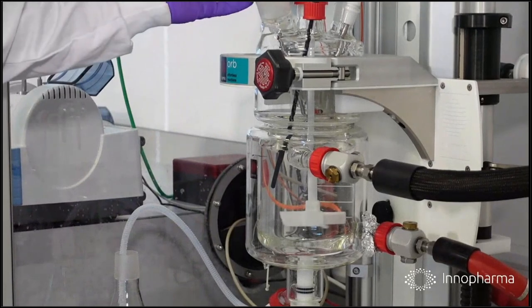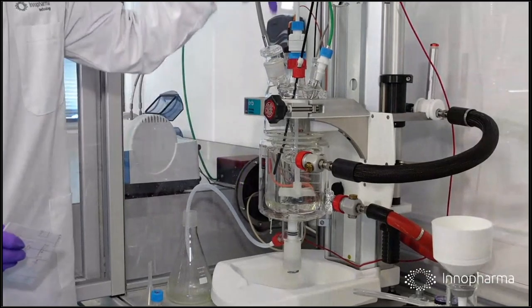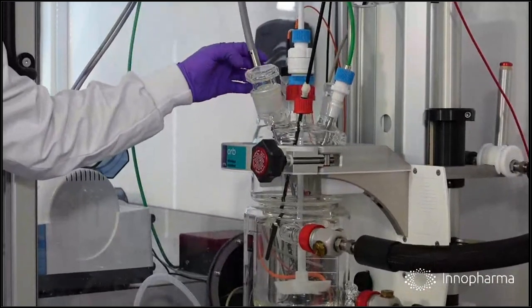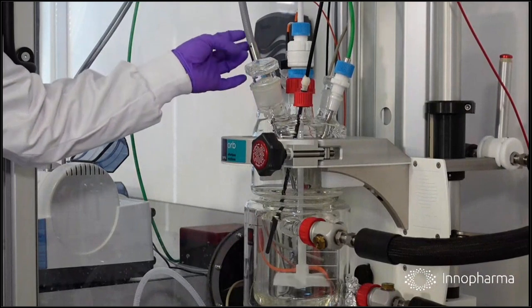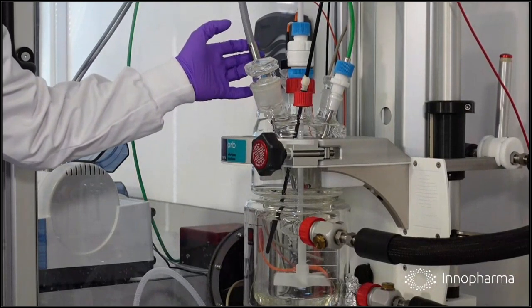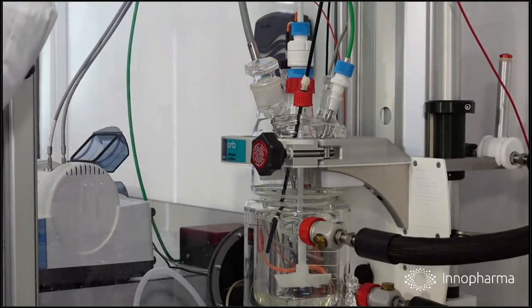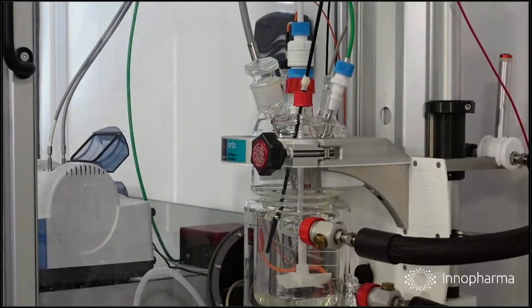On the top here, what we have are the analytical instruments. They're inserted from the top. This is just a temperature sensor, but here we have the more advanced analytical technology probes. There's a probe here for FTIR, Fourier transform infrared spectroscopy, and there's a probe here for Raman spectroscopy, two of the instruments that we'll discuss later. We also have a probe here of our own for the near-infrared spectroscopy. So three spectroscopy techniques that we'll be discussing today. In fact, that's the reason that we've chosen this reaction to discuss.